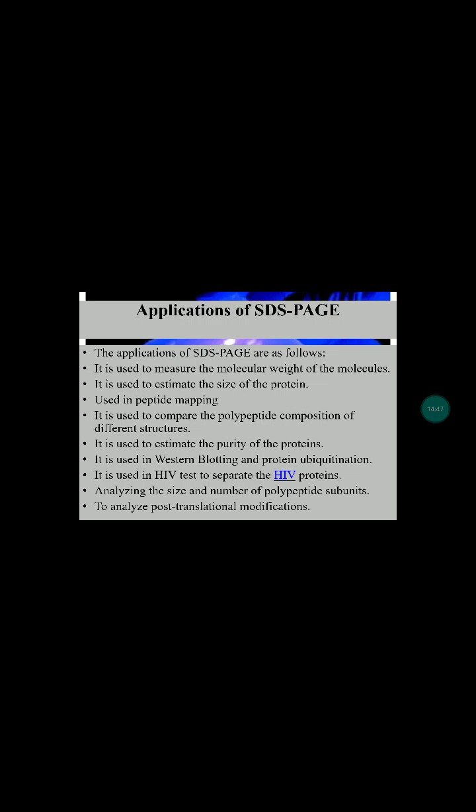Electrophoresis: the gel cassette is removed from the casting stand and placed in the electrode assembly. The electrode assembly is fixed in the clamp stand. 1x electrophoresis buffer is poured in the opening of the casting frame to fill the wells of the gel. Load 30 microliters of denatured sample in the well. The tank is then covered with a lid and the unit is connected to a power supply. The sample is allowed to run at 30 mA for about 1 hour. The bands are then seen under UV light.